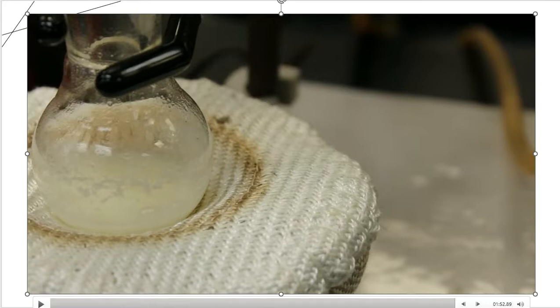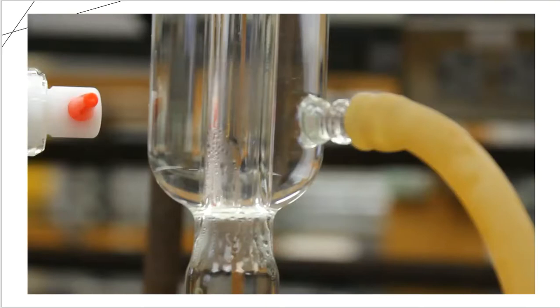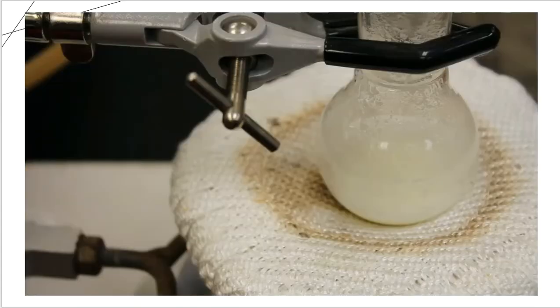All right, so in the video, you are probably seeing a little bit of product in the drips, but quite honestly, a lot of that is also the methylene chloride. Methylene chloride has a really low boiling point, and what you are seeing is a low boiling point organic compound getting released from that boiling flask and traveling up the condenser as well. So a lot of that is methylene chloride. There could be some product mixed in, but quite a bit of it is methylene chloride. So we'll continue on video after video, and we'll continue to watch this process as it heats and as it refluxes.